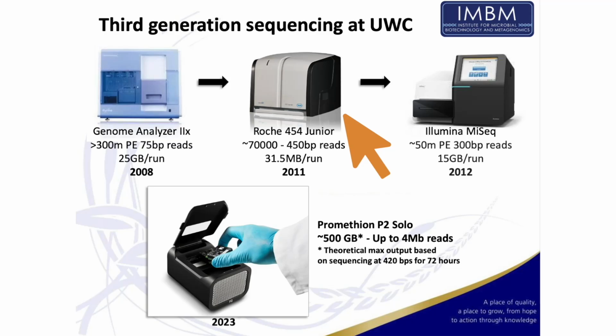So you can see much smaller output. The read length now has improved substantially, but this, because we're focused on bacteria, would allow us to finally start sequencing bacterial genomes. This was quite disappointing. We paid 1.4 million for it. That's all taxpayer money. And a year and a bit later, Roche said they're no longer supporting the technology. That was a bad day. All right, let's forget that.